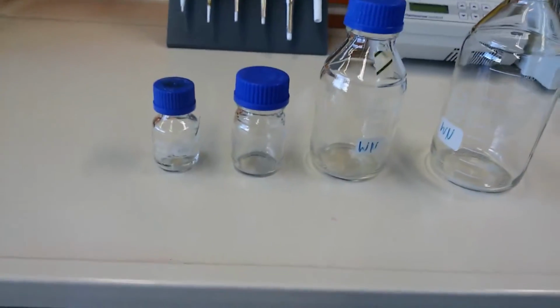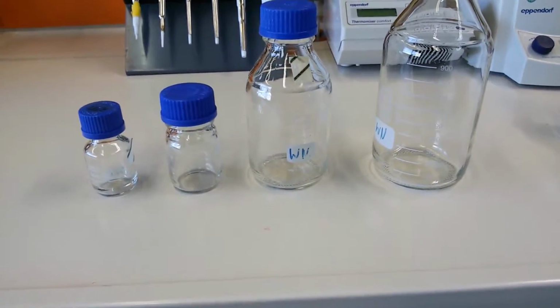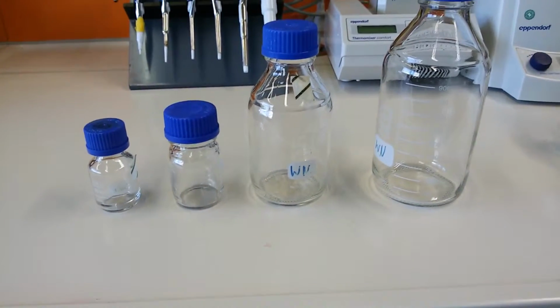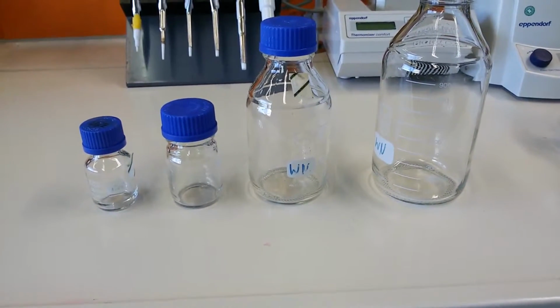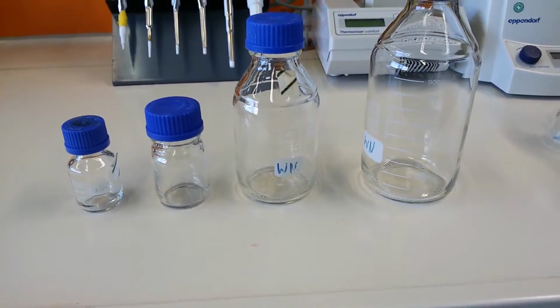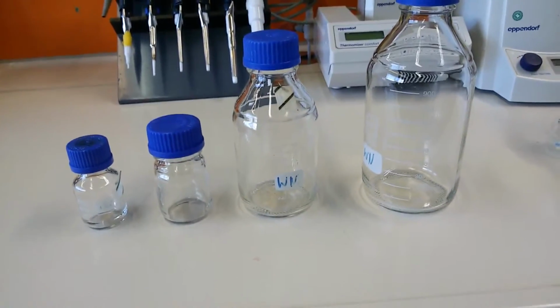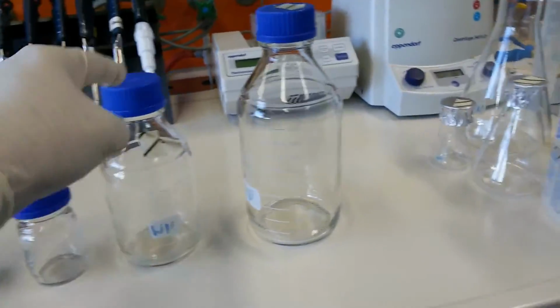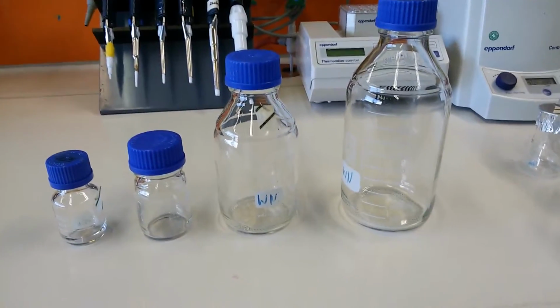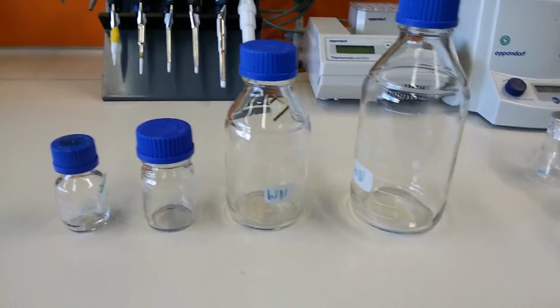Now they are a very important part of lab utilities. We prepare all the buffers and all the chemicals in these bottles. We also use them to prepare sterile water, sometimes to prepare media, etc. As you can see, they are closed from the top and they have very tight packing. So we use them to store things, to store buffer, water, anything.